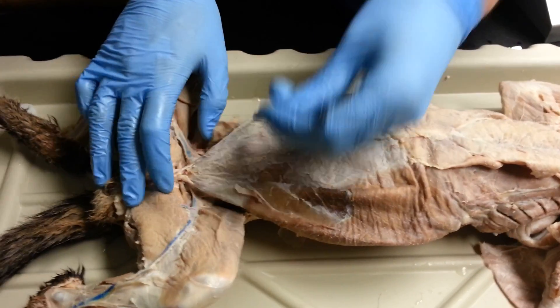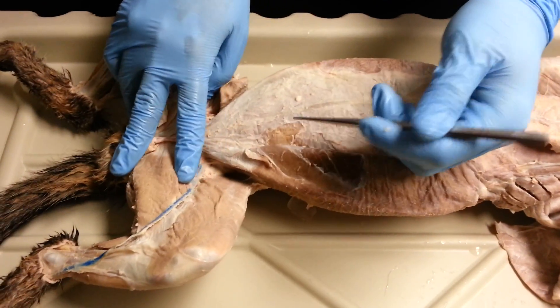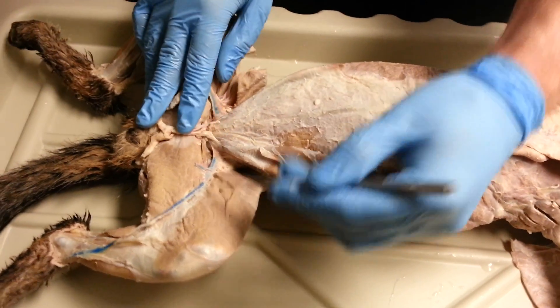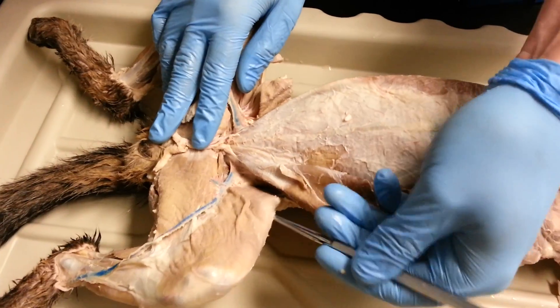We're going to start with the lower body. This is the easy one because there's less in it, so we start with the easy ones. We're going to start with the sartorius, the tailor's muscle, and the gracilis. These are easy, big muscles. They're hard to miss.